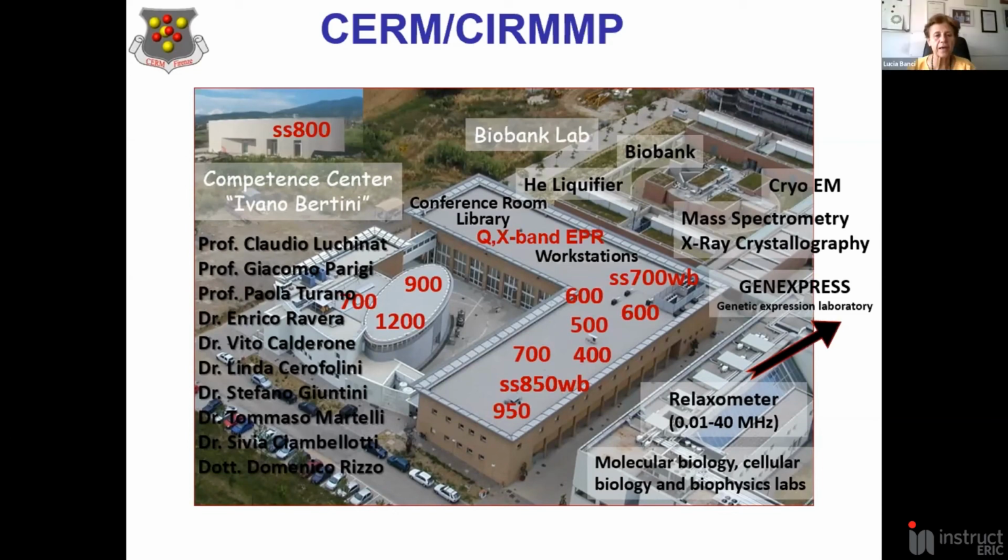A question: can you comment on the preference of using proton-detected experiments for the assignment? I think that to assign, you have seen that we have assigned this very big protein, but the assignment was possible by integrating, as I told you, for example, the data collected on the protein using solution NMR experiments for the more mobile part of the protein, using a deuterated sample.